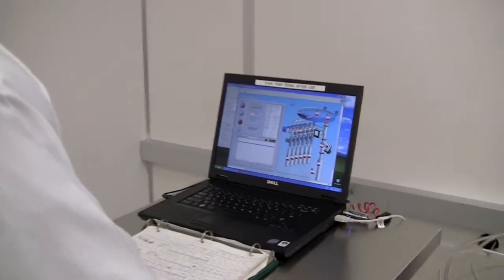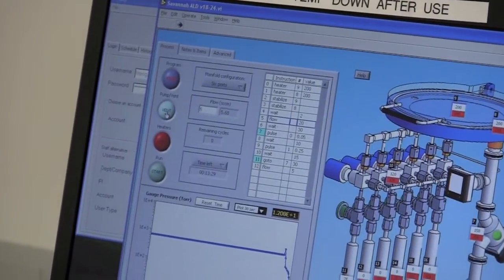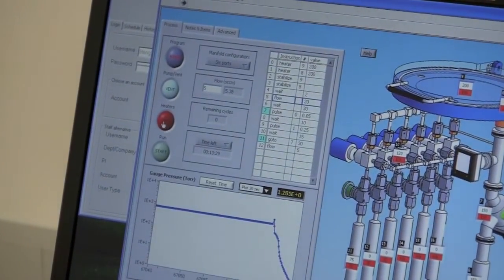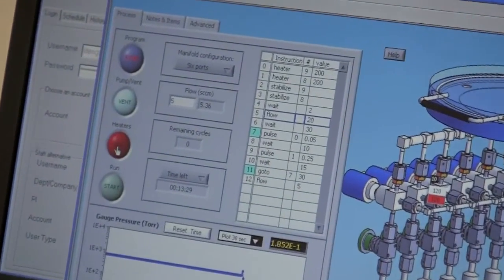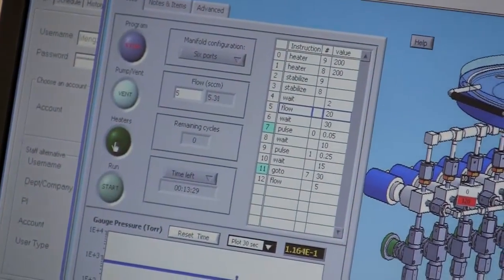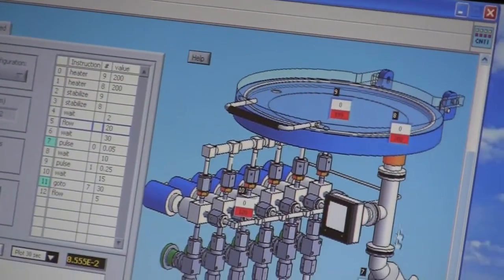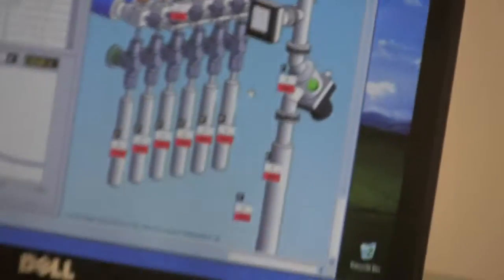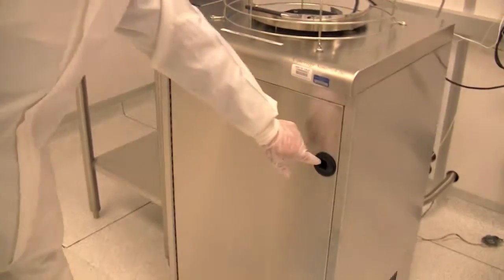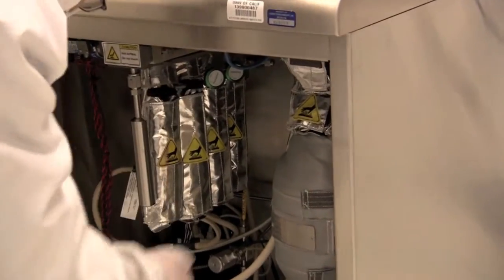And click the pump button to pump down the chamber. Click this red button to close all the heaters. And you see, the temperatures are set to zero. Last, don't forget to close the valve of the precursor bottle.